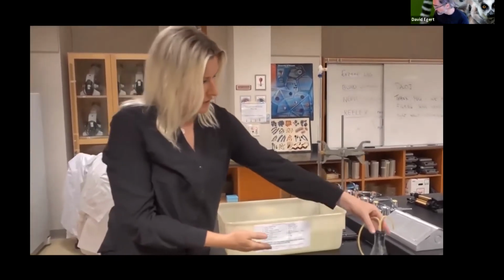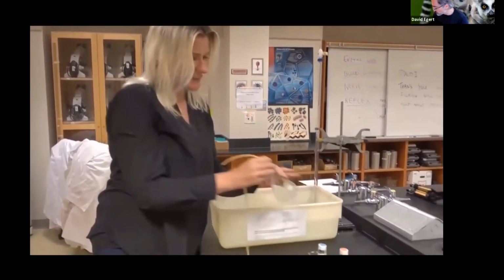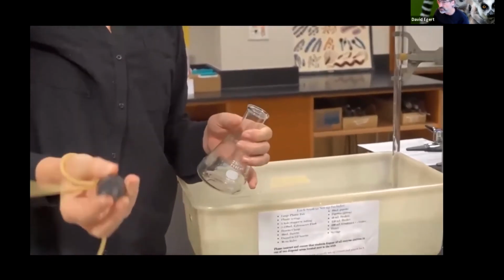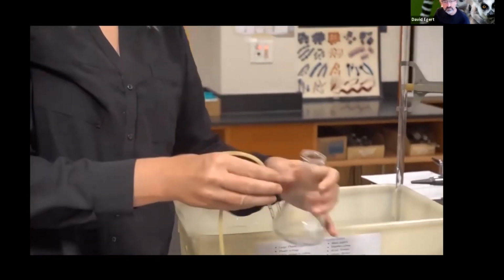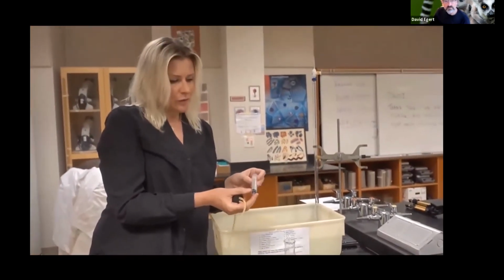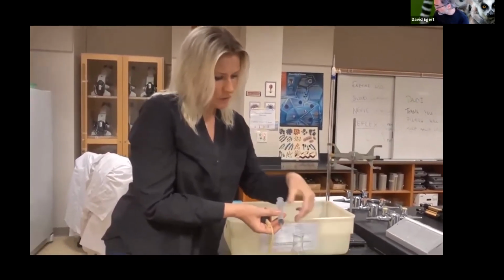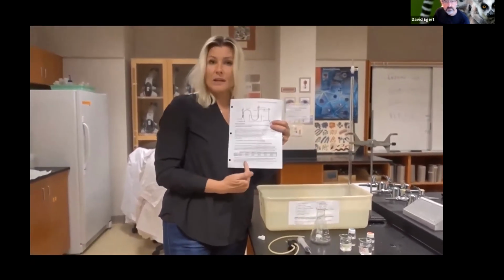But before that, we're going to take a look at some of the other equipment. What we have here is just an Erlenmeyer flask with a stopper. It has 2 glass tubes and 2 hoses here. The shorter hose you're going to use for your syringe. This syringe has milliliter marks on it, and this is where you're going to do your dilution according to this table down here.